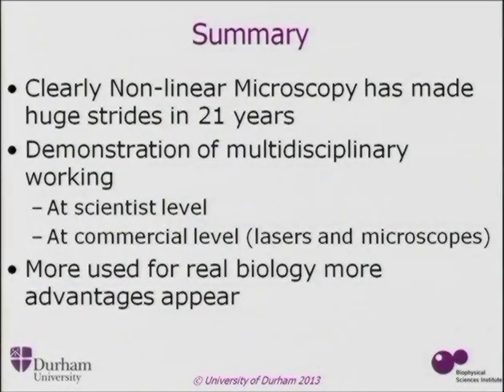So in the case of nonlinear microscopy, it's been around 21, 22 years. And it's actually a really interesting example of how multidisciplinary science takes place. So you need very often optical physicists, laser physicists, engineers to put all the bits together. At the commercial level, special lasers, femtosecond lasers were around, but they've now been specially engineered just for use in biology.